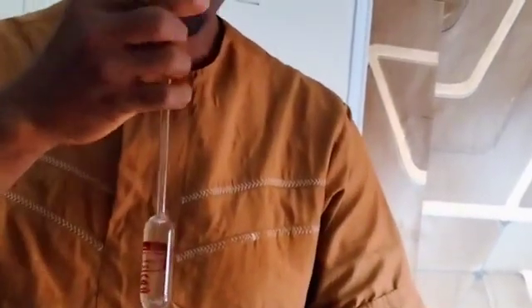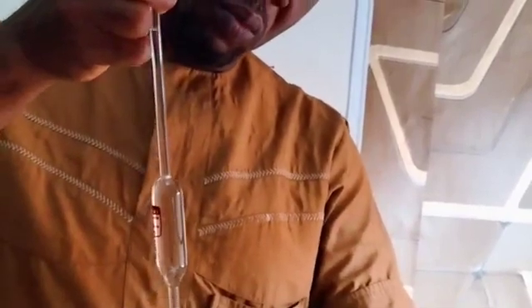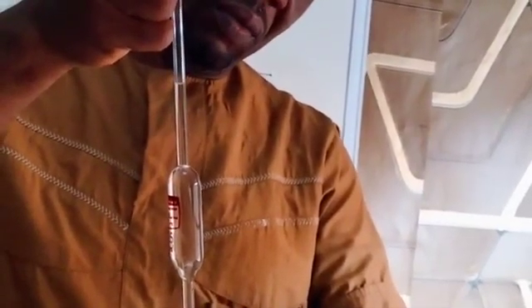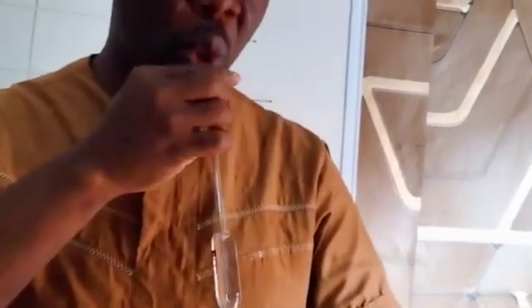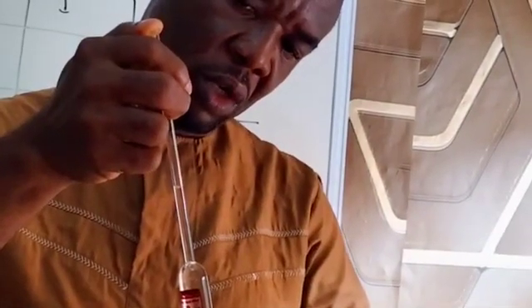Bring a neat conical flask. It has gone down, so we'll have to add more. So adjust your hand, allow the air to enter, and watch the meniscus, the bottom of the curve, as it's going down to sit on the ring. Gradually. Okay, we're getting there.